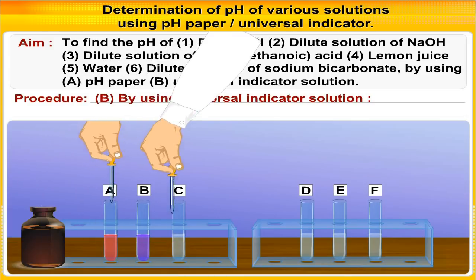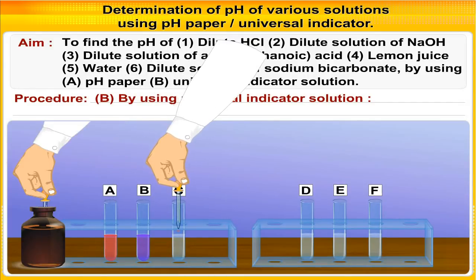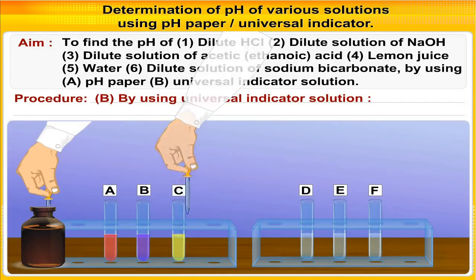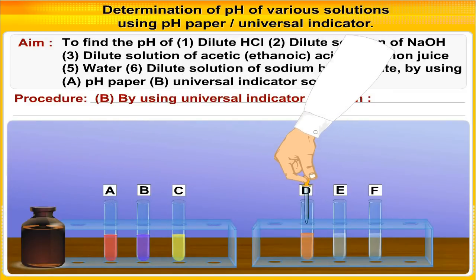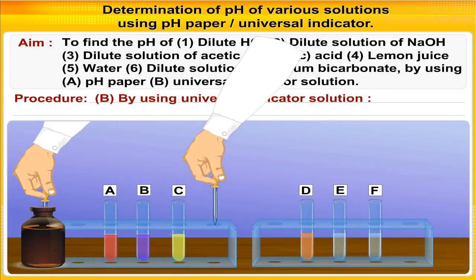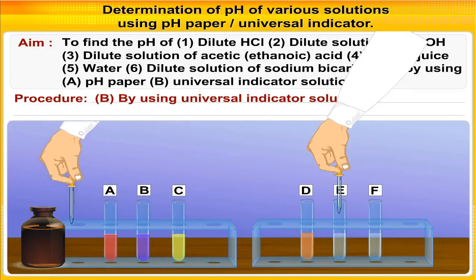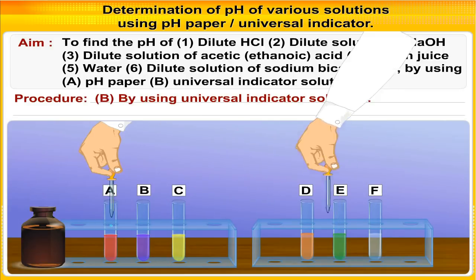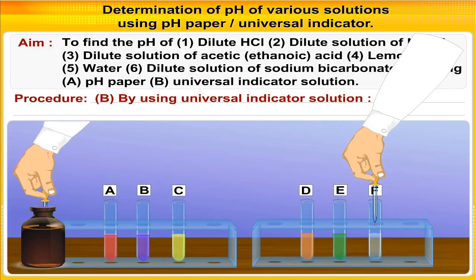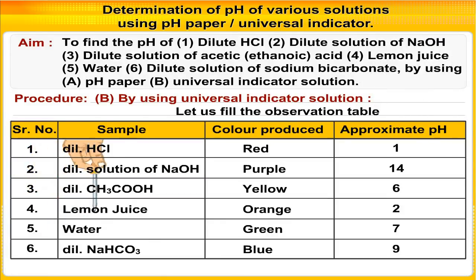Now repeat the same procedure for other samples and note their pH in the observation table. This is the observation table, same as the earlier table.